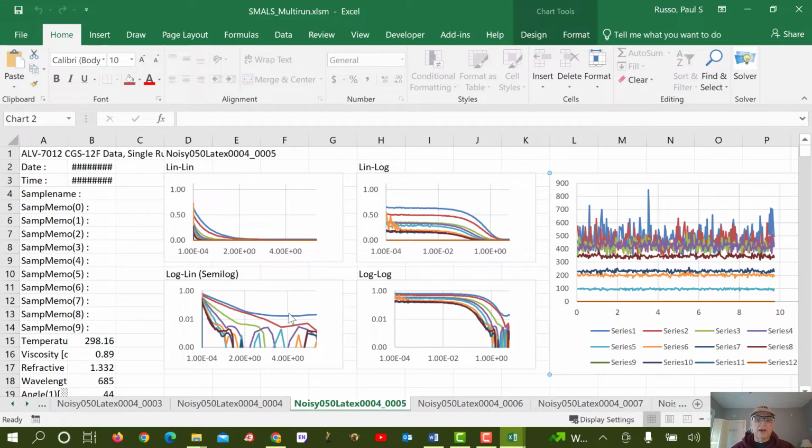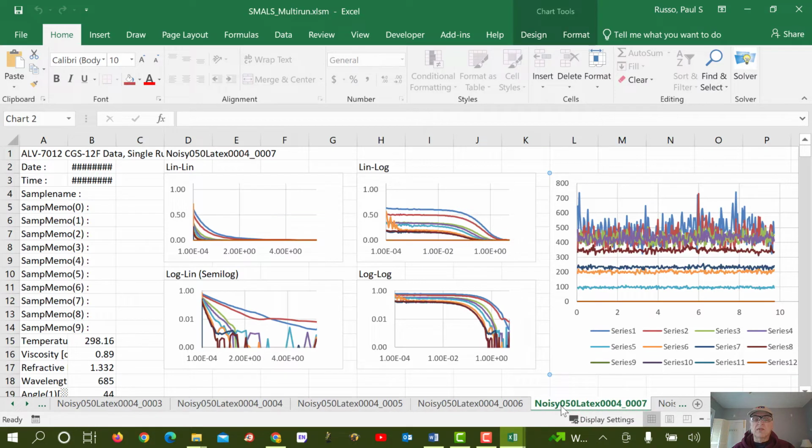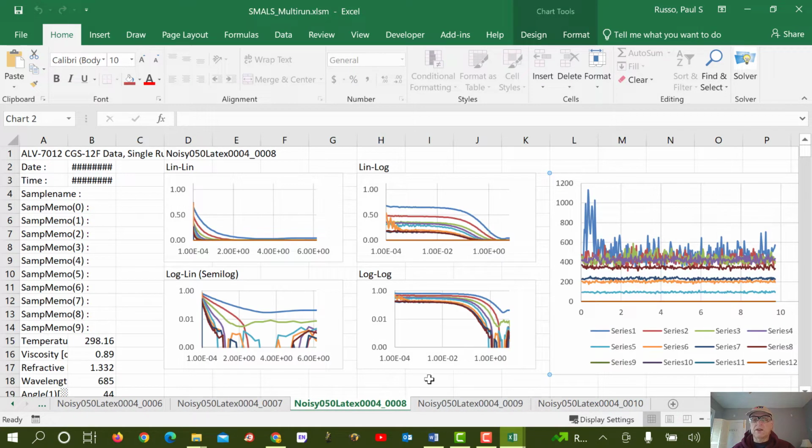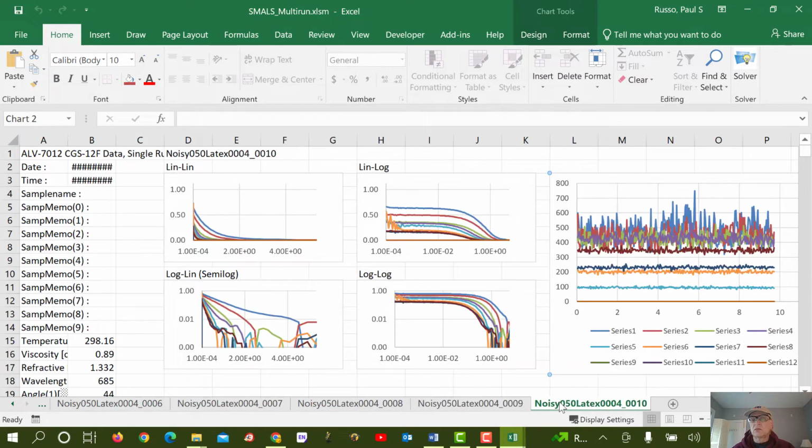I don't know. So flattening there. I guess I'll kill 5. 6. Mess. 7. Oh, we got lucky. So far it's 4 and 7. 8, disaster at the beginning. Disaster on 9. We're going to say 10 is a keeper. So it's 4, 7, and 10.